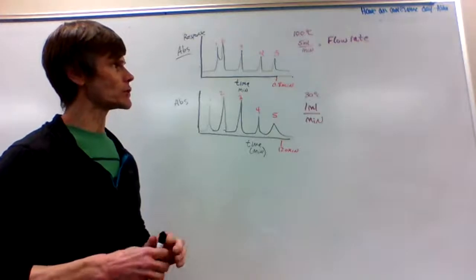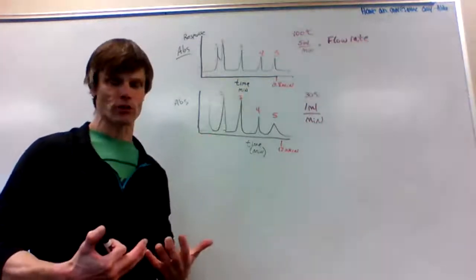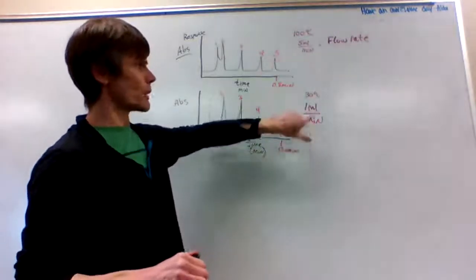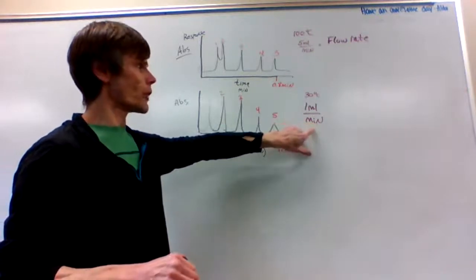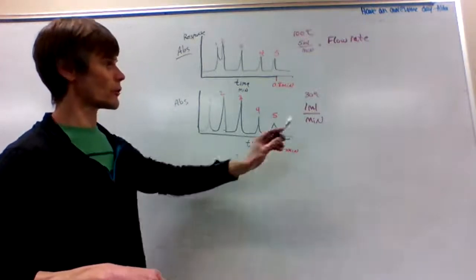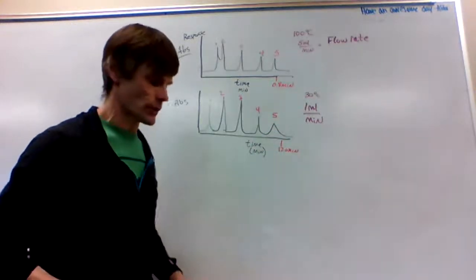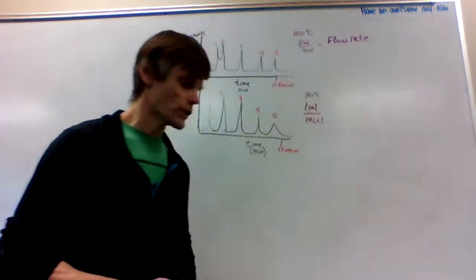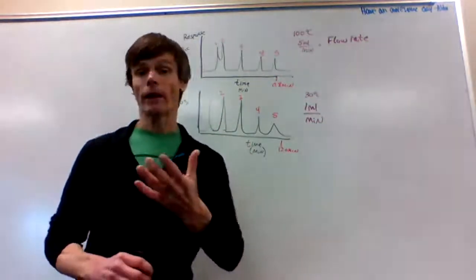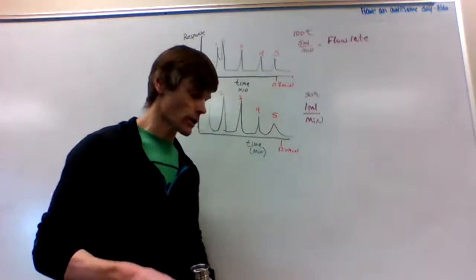Notice some factors that I changed here. We've changed the temperature. That's one factor that we can change in an experiment to encourage a separation. And we'll be discussing that in a few minutes. And we've also changed our flow rate for our mobile phase. Notice the slower flow rate cost us more time. So that might be something you would recognize right away. A slower flow rate costs more time, but it looks like for this example, we got better resolution. So those are two factors that we can change to create better resolution: temperature and flow rate. And there are several other types of parameters that we can change to encourage our resolution.